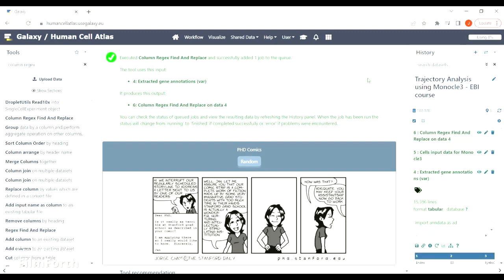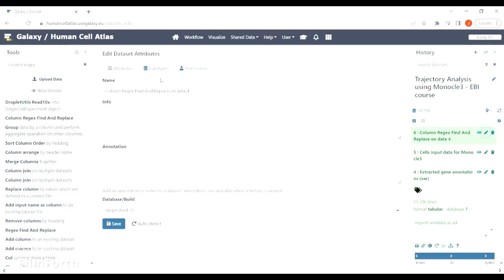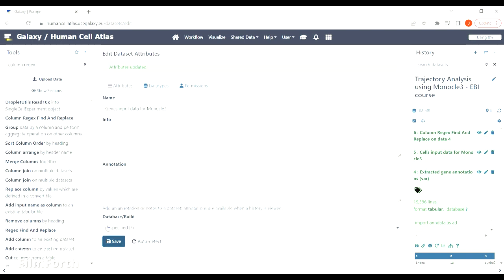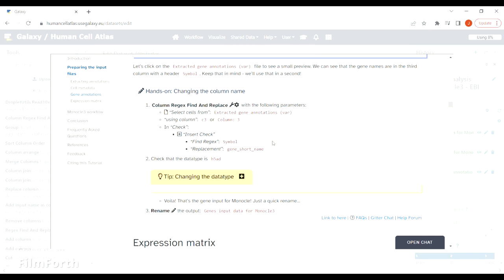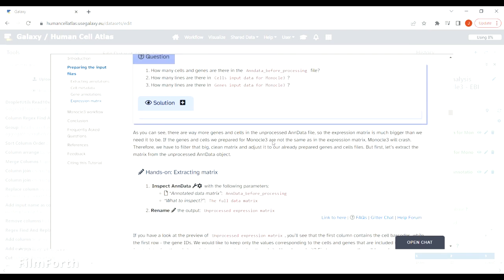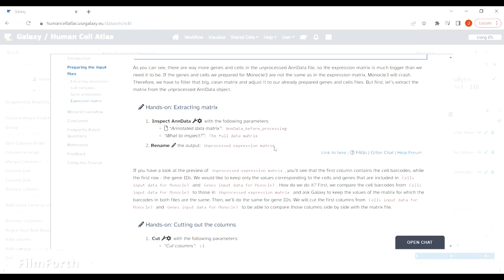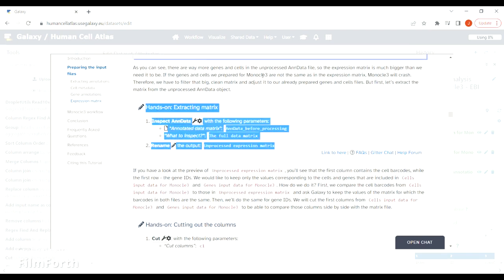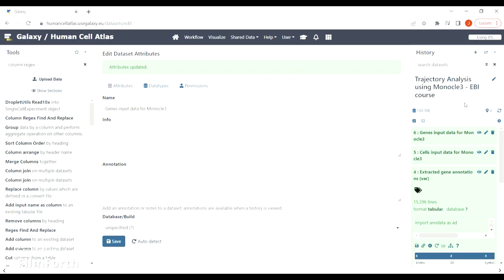This is the file that we are going to use as input data for Monocle 3, so let's rename the file so that it's easier to navigate afterwards. We've prepared information about cells and genes, so now let's move on to the expression matrix.